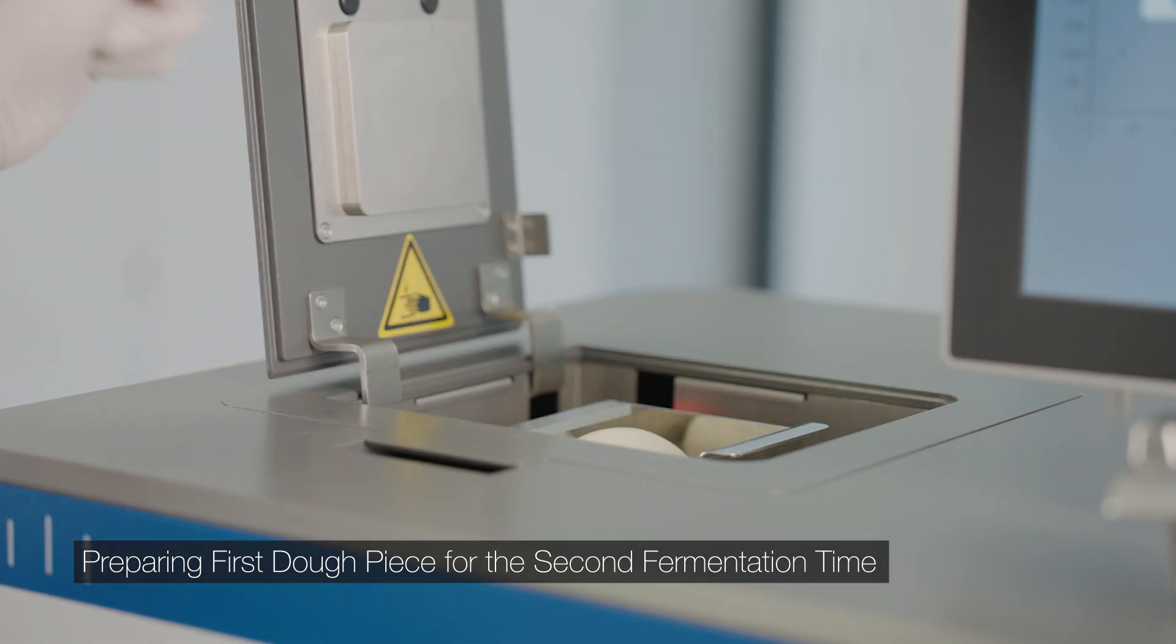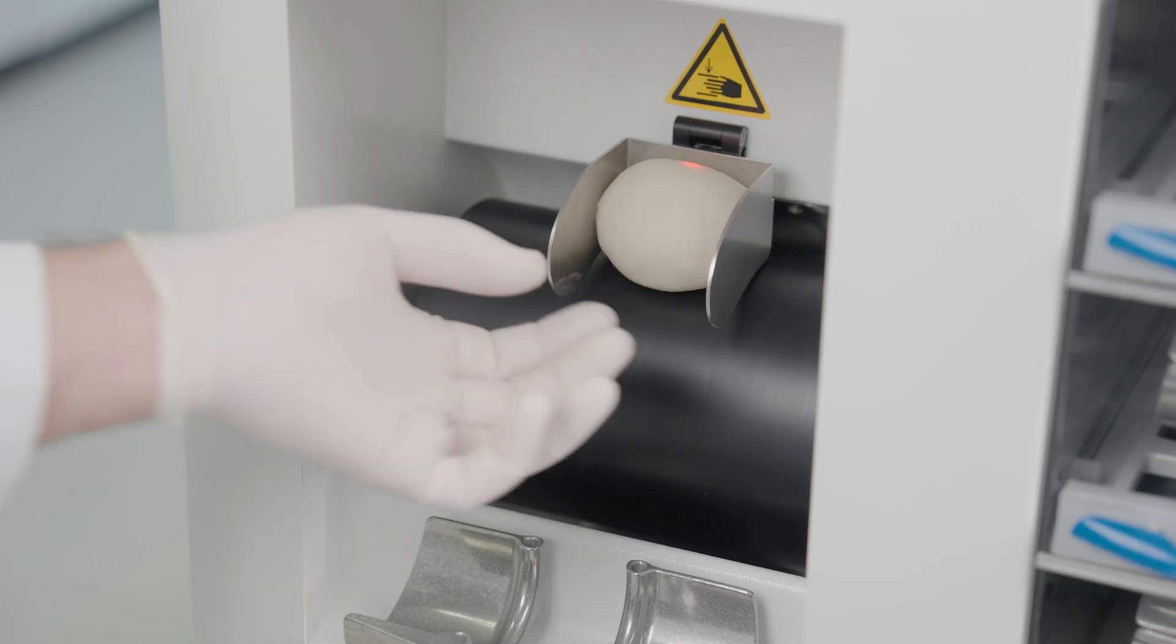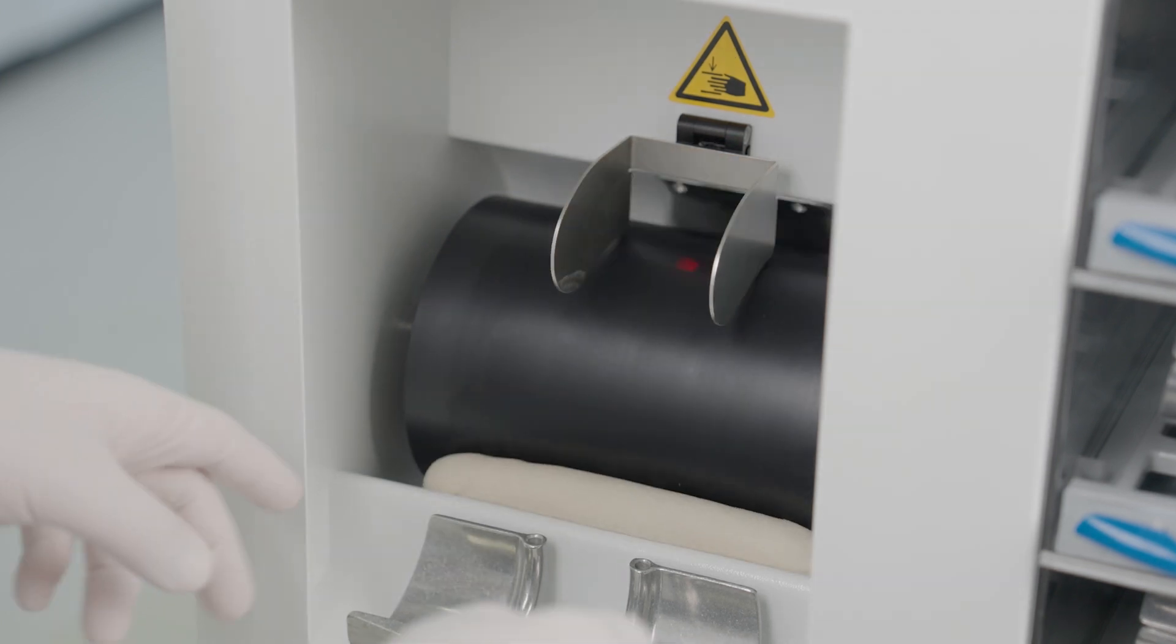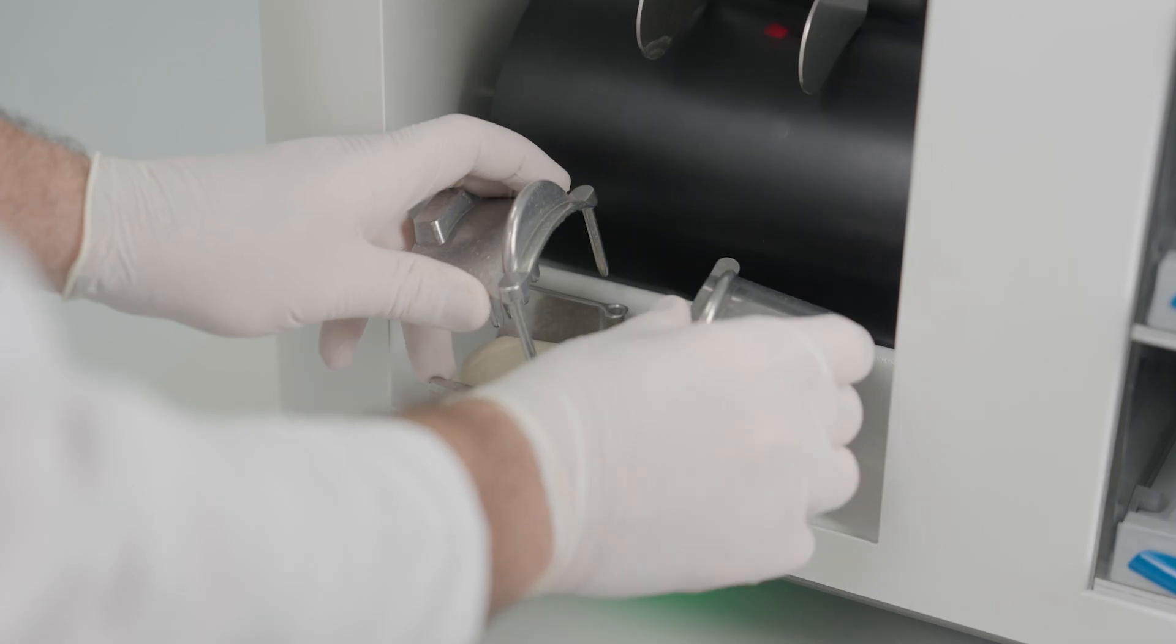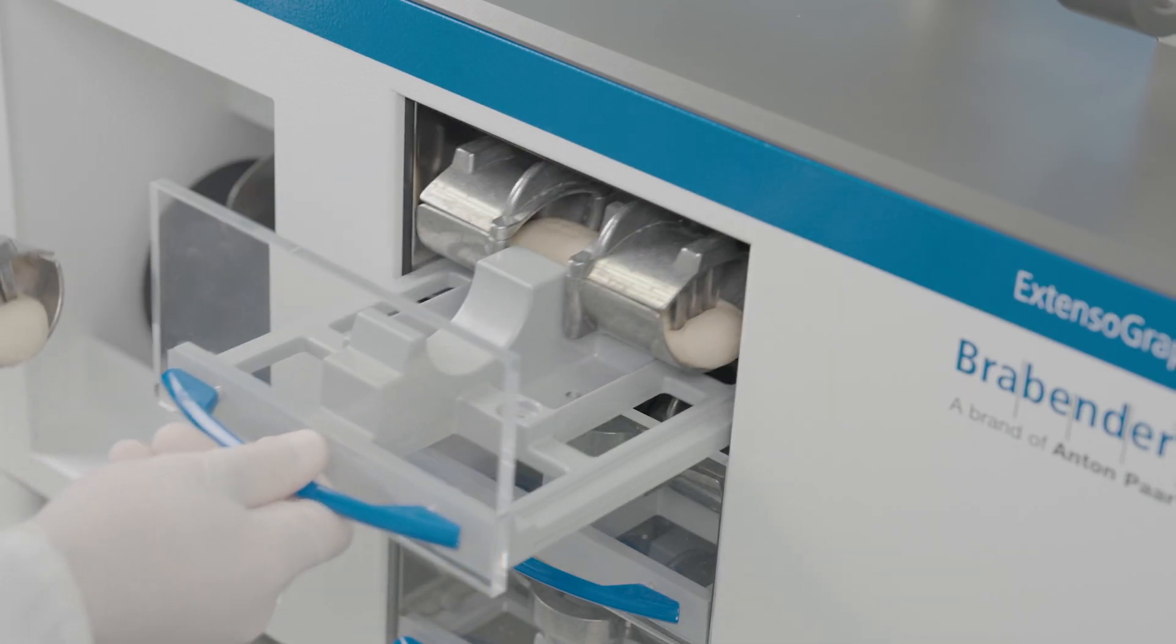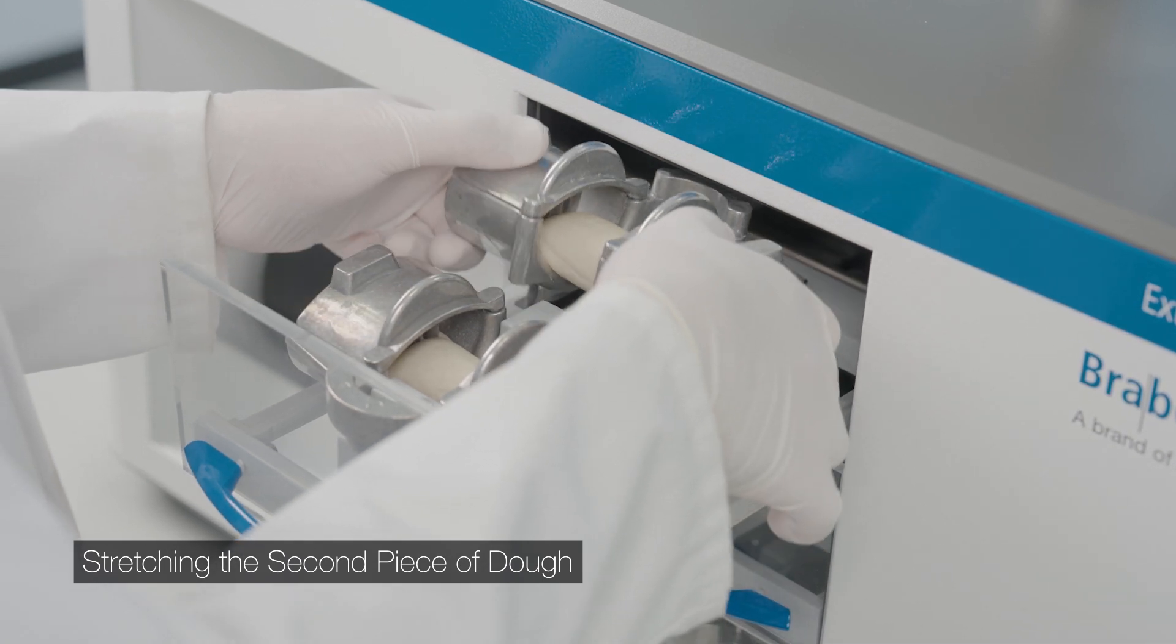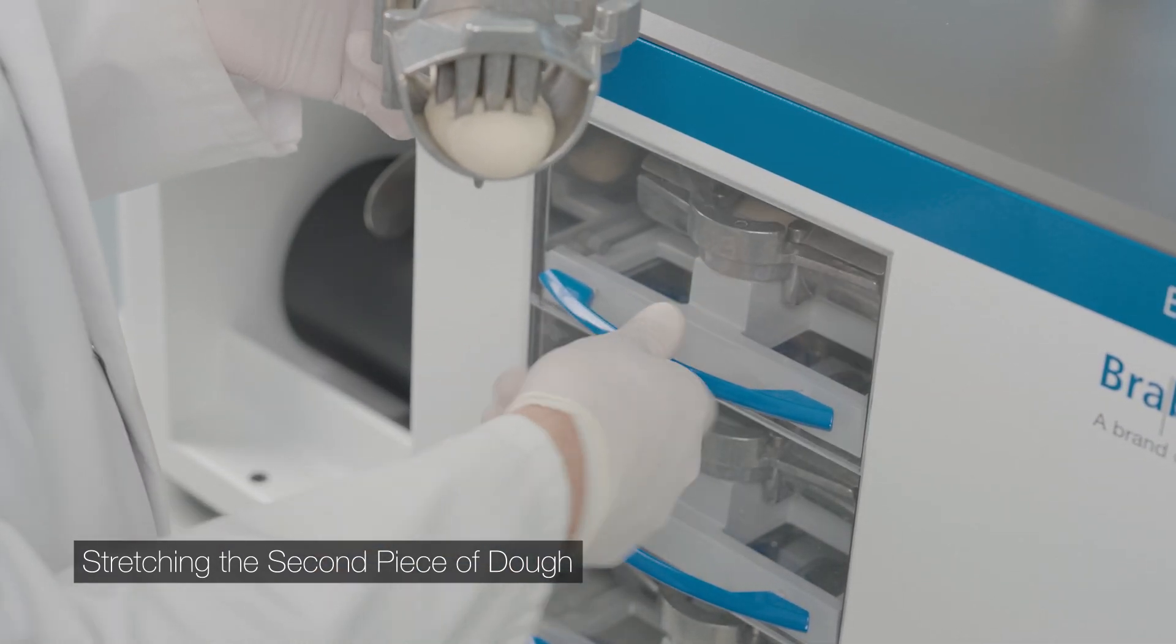Homogenize the piece of dough in the balling unit, then shape it with the dough roll. Place the dough strand in the tray and fix it with the clamps. Insert the tray into the fermentation cabinet and put the second sample onto the stretching device.